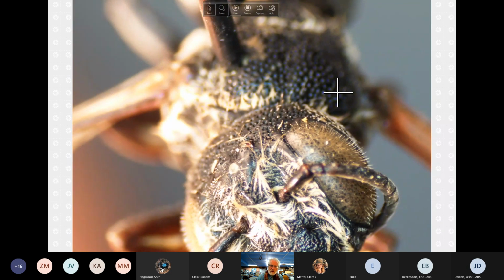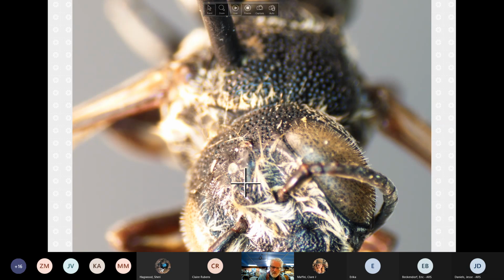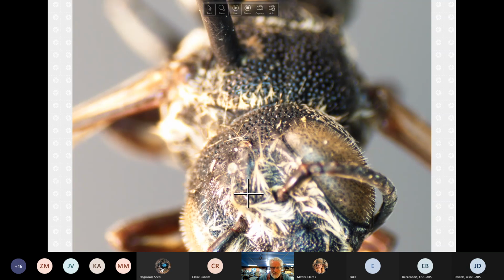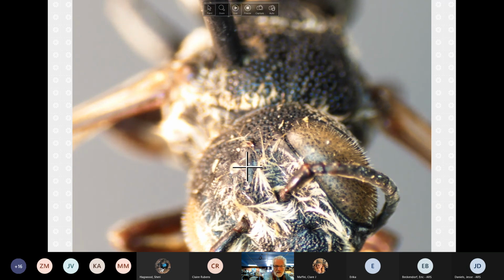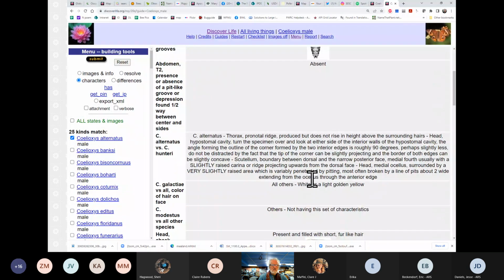and this area, a little bit tricky to see here, but this is raised, and at least on the lateral sides, there's no pits. And then in alignment with the longitudinal axis of the bee, there's pits going in through a small depression to either side of these parens of raised spots. Let's see what the difference is.